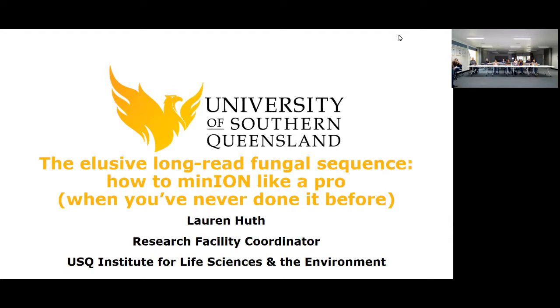It's taken me some time, particularly in the last year, to get this to work for fungi. I always felt like it would be great to see something like this before I got started. It probably would have made my life a bit easier. So what I wanted to do today was give you a beginner's overview of the minION, how the technology works, and also give you some tips and tricks that I've found along the way that have made this a bit easier for me, so that you don't have to find out the hard way like I did.